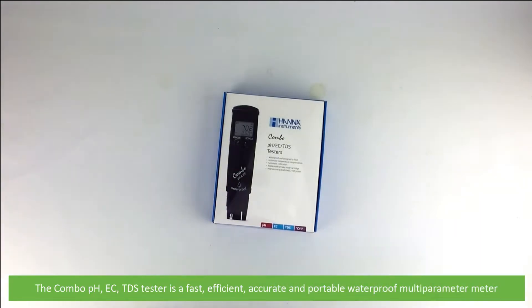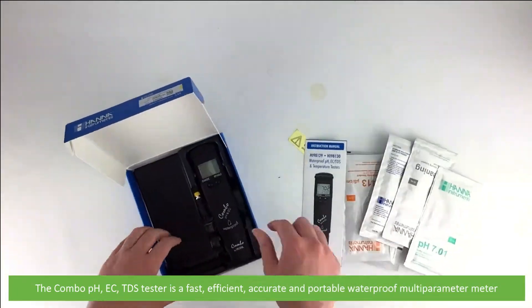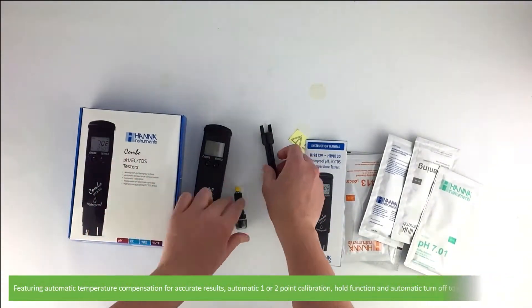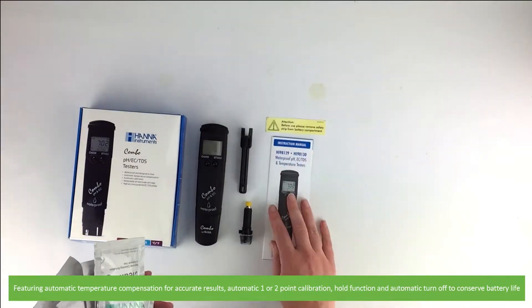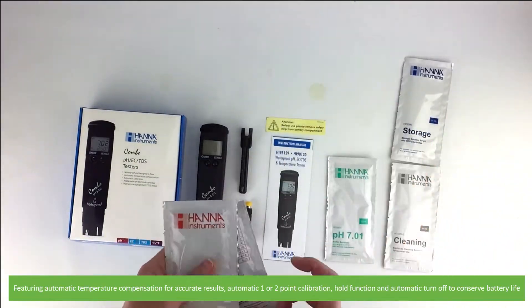The Combo PH/EC/TDS tester is a fast, efficient, accurate and portable waterproof multi-parameter meter. It features automatic temperature compensation for accurate results, automatic one or two point calibration, a hold function and automatic turnoff to conserve battery life.